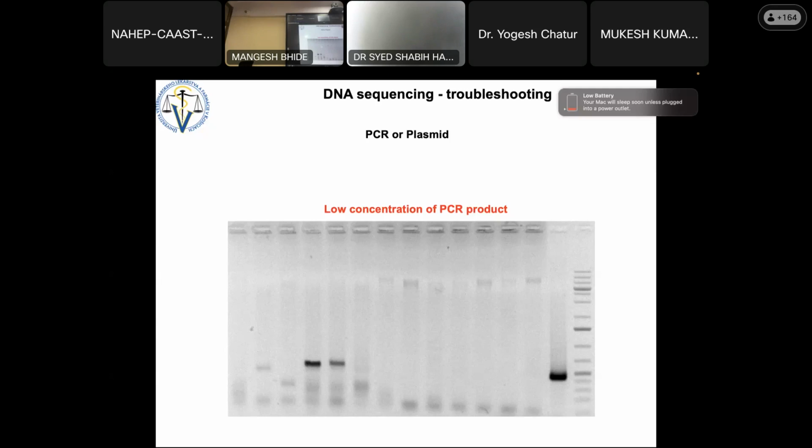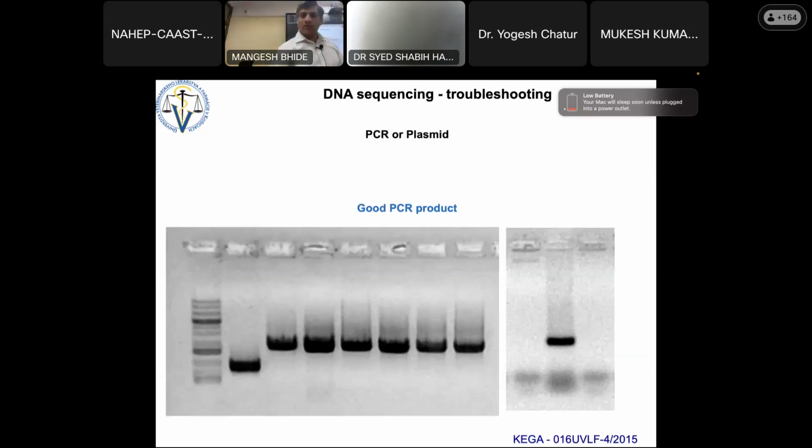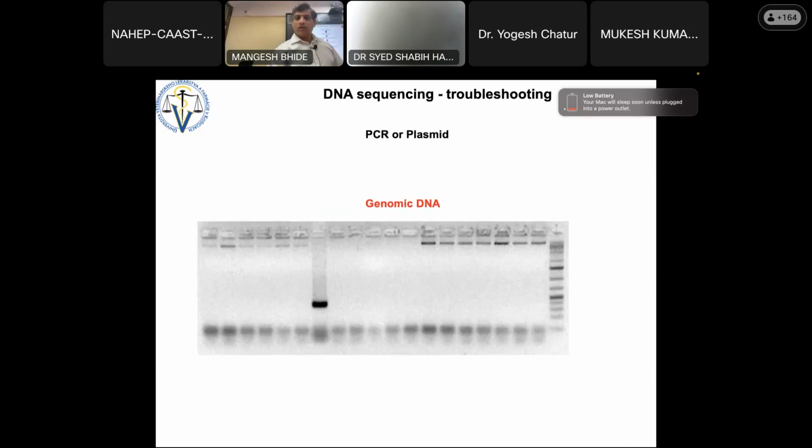Yeah, but you can have this contamination. So I just cut this band and throw away the small piece. I just cut here, throw away. And you may have sometimes this one. So I also tried to cut out genomic DNA and the ladder. So I take only that, but still it is a lot of recycling. Yeah, also, so you also recycle. Yeah, resolution affects.